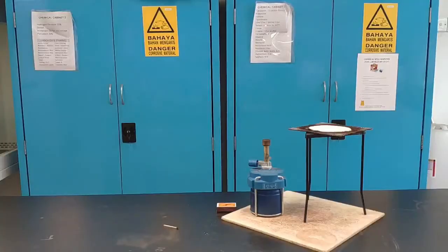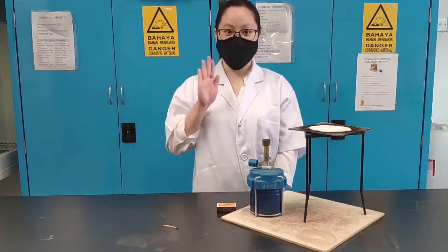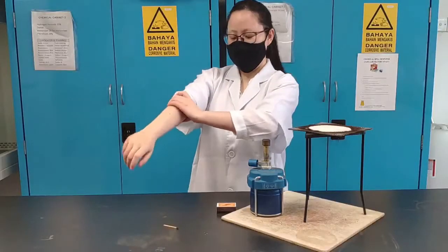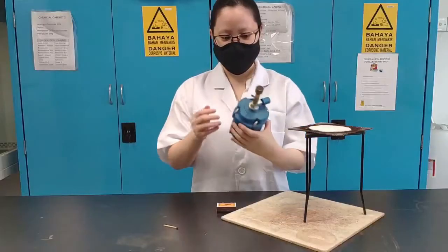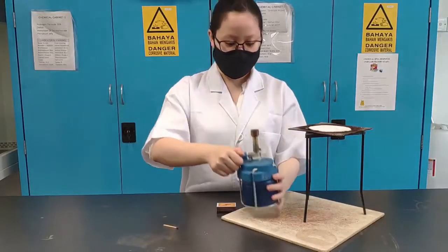Hello everyone and welcome to this video on how to light a Bunsen burner. First off, please tie your hair and roll up your sleeves — make sure they're out of the way. If you have any loose papers, make sure they're far away from the Bunsen burner as well.